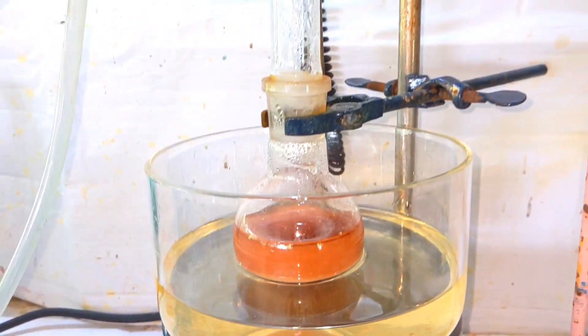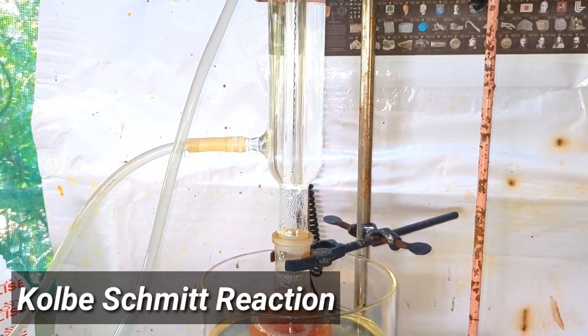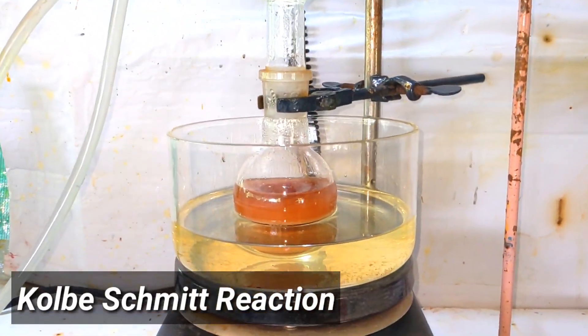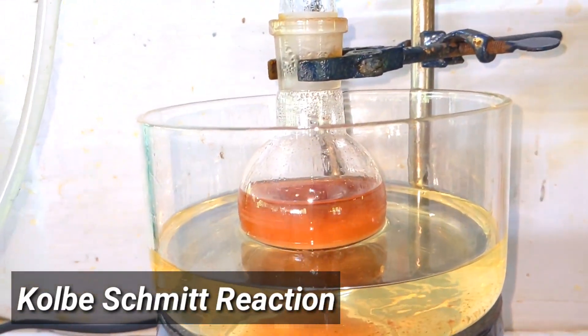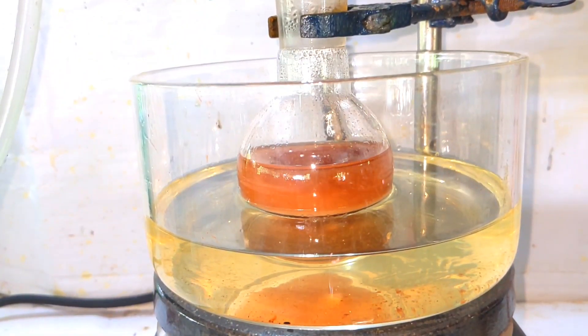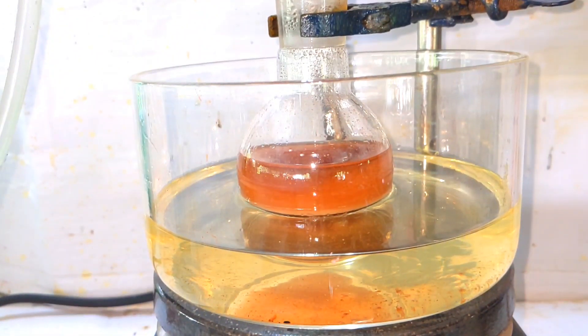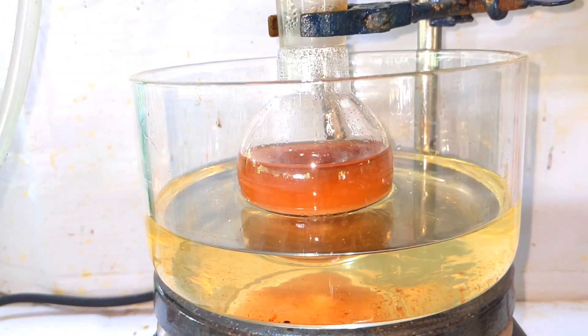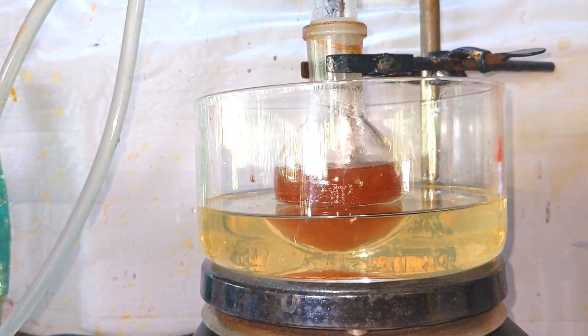What is happening here is called the Kolbe-Schmidt reaction, where the phenylates are carboxylated to form the carboxylic acid. Generally this carboxylation takes place at the ortho position. This reaction usually needs very high temperatures and high pressures for monohydric phenols.